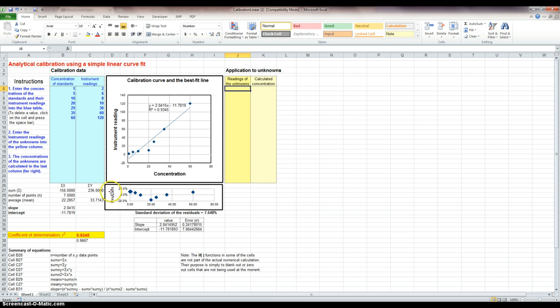Now you may want to do a little more investigation on residuals, and right now it's stimulating me to think more about it and want to read more about it, of can I treat residuals just as coefficients of variation? I know they are a parallel of that, but would you treat these numbers exactly the same? As a plus 20 to minus 20 acceptable? Now, since I know that this looks pretty good and my numbers are pretty tight, then that would be okay.